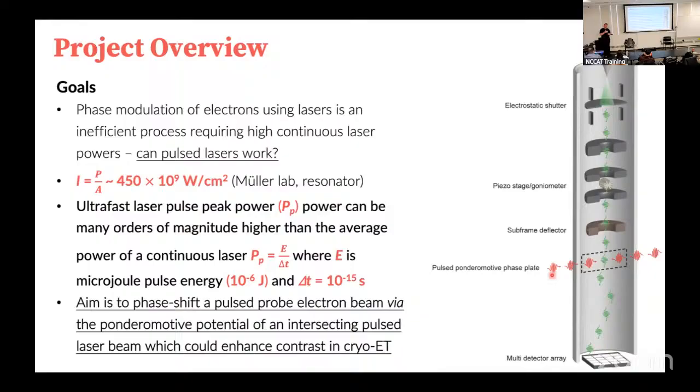But whenever you set up the standing wave in the resonator, that allows you to have some degree of control over the behavior. It's almost like a continuous block of photons that you're passing the electron beam through. In our case, we are trying to synchronize the electron packets, the single electron packets, with single photons.